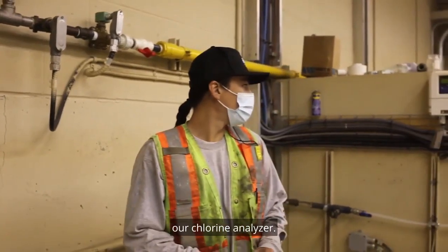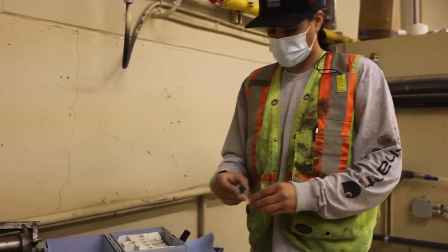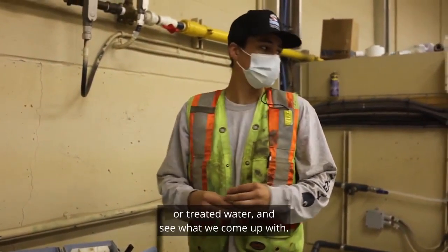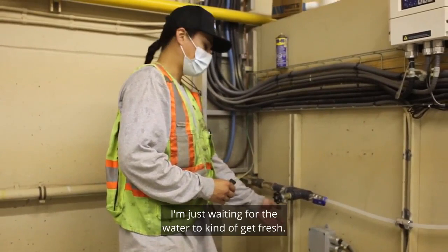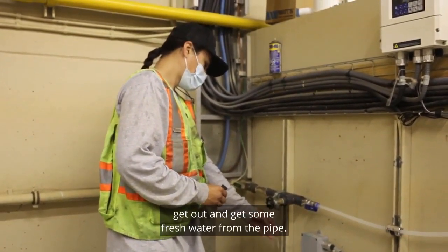We're going to be calibrating our chlorine analyzer. First thing we're going to do is take a sample of the treated water and see what it comes up with. I'm just waiting for the water to get fresh, so I'm going to get some fresh water from the pipe.